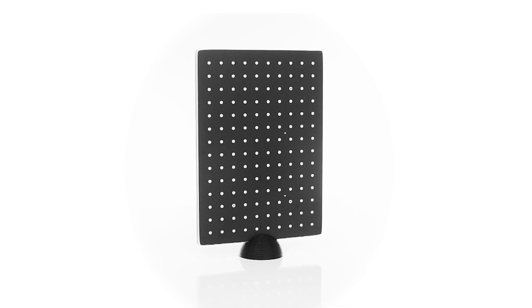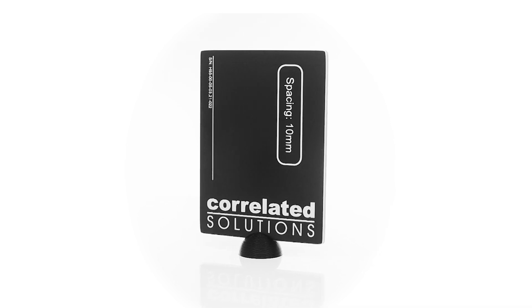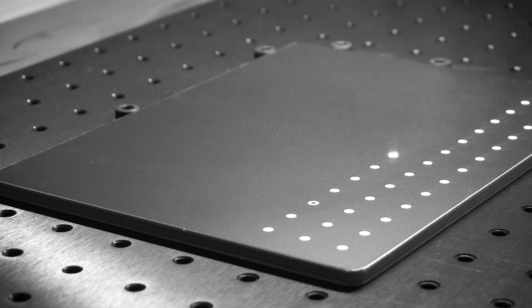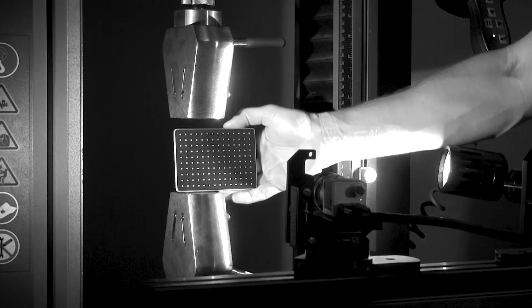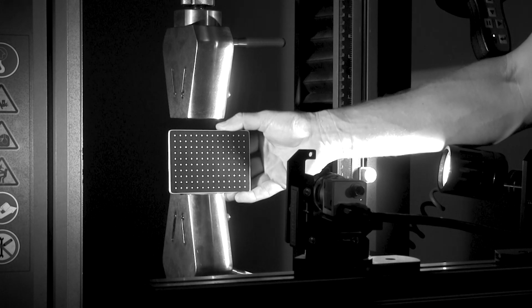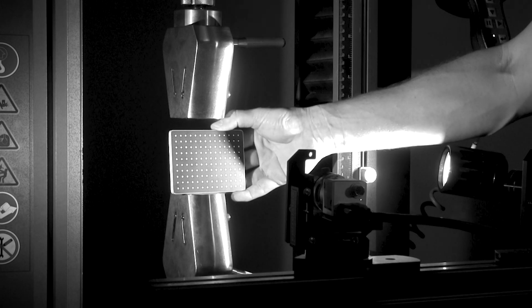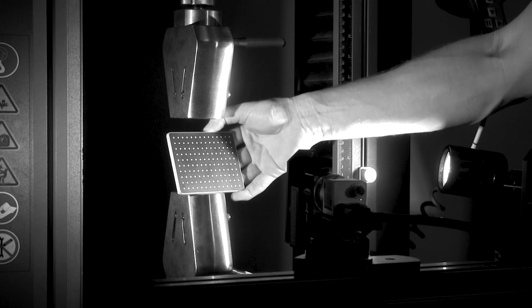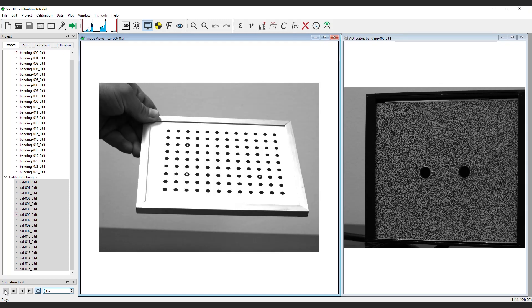In 2021, Correlated Solutions started providing laser-marked calibration targets to allow for more robust calibrations. These laser-marked targets are black anodized aluminum panels with the anodization removed by laser marking. While the new method provides much more precision and the targets are more durable, the surface of the panels can create more reflections, both in the marked regions and outside area, which can make calibration more difficult in some situations. We will specifically address the reflection issue in this video. If you are using the previous white targets or printing your own targets, this tutorial will still be valid.